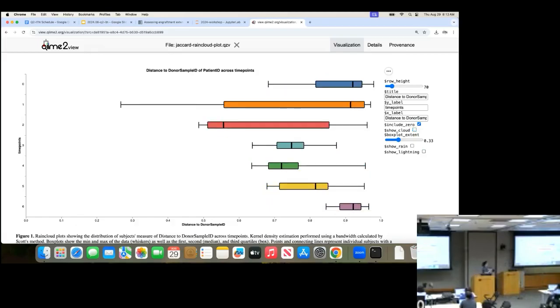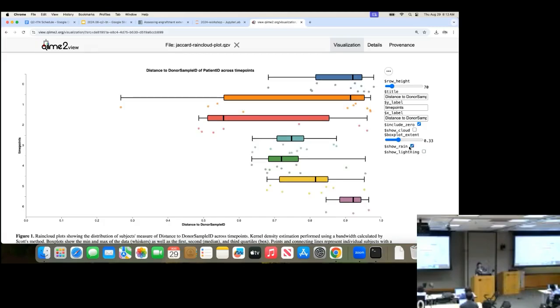So everyone's probably familiar with the box plot. You've probably seen these a million times. I kind of hate them. And that's a strong opinion, but I just think there's so much data variability that I'm not able to see there. I'd like to know where all the data points land. And so I think that's why we typically see this, right? Some people put a scatter on their box plot that gives you a better idea of how that data variability plays throughout your groupings, which I think is really cool.